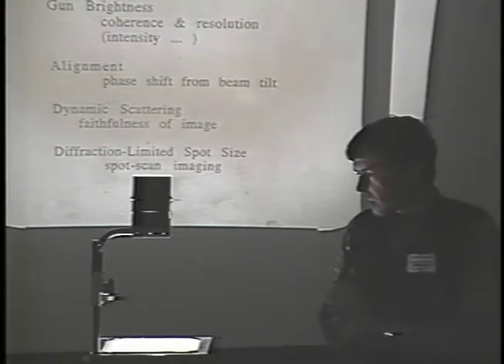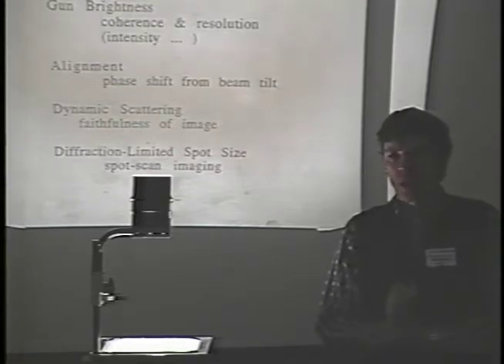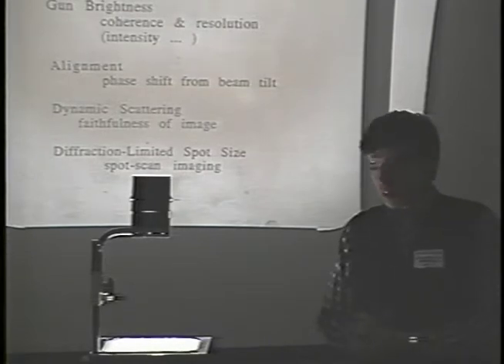Now, again, because of the higher voltage, the sensitivity of that phase shift is a little bit lower, and that should make processing of the data that we get significantly easier.